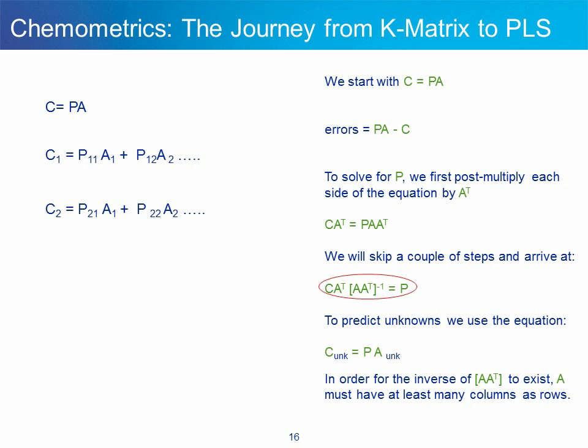What happens if we needed to use, for instance, the spectral region between 1700 and 700 inverse centimeters to solve the problem? This would require 250 wave number values at a resolution of 8 wave numbers. In most cases, we don't want to collect 250 calibration standards.